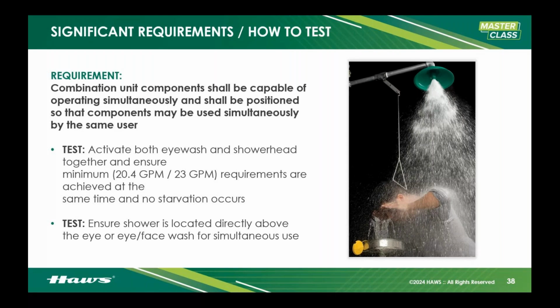And then watch out. There's a very, very sneaky issue here, and it's called simultaneous operation. That's how we refer to it. The shower head uses the most water on this piece of equipment, and water very frequently takes the path of least resistance through the equipment. Okay. Now, as it's doing that, very frequently, if flow controls are not being used in the emergency equipment as they should be, the shower will starve the eye wash or eye face wash, and you will get a shower that is running with zero eye wash or eye face wash water coming out because it's hogging it all. It's starving the other half of the unit.